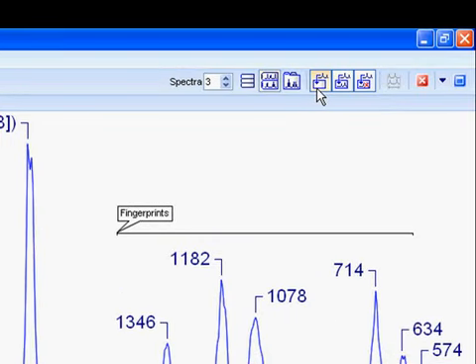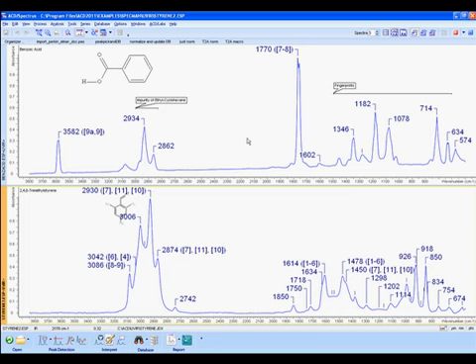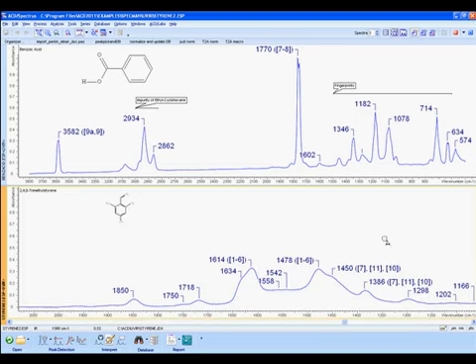Note that spectra are presented in this way because we are in Add New Window mode. Whenever we open a new spectrum, we create a new window for it. Depending on your workflow, you might prefer to use the replace mode, where only one window is used and every new spectrum will replace the previous. Or you can choose to add new spectra into the current window, creating a series of spectra. When using multiple windows, the orange highlight will denote the active window. Any processing would be performed on that spectrum alone, zooming included.